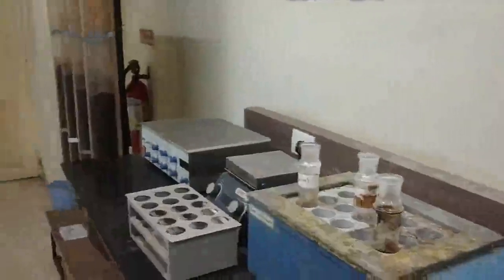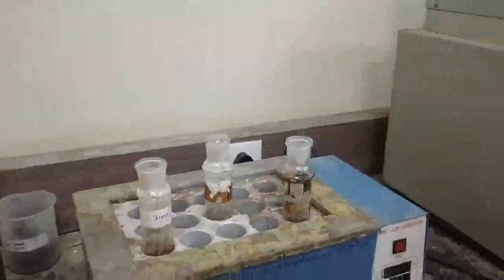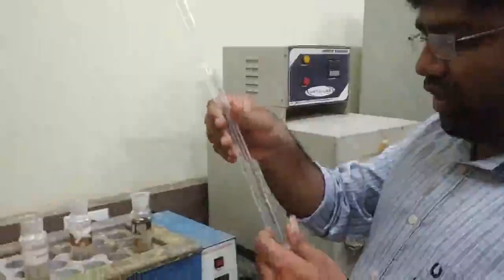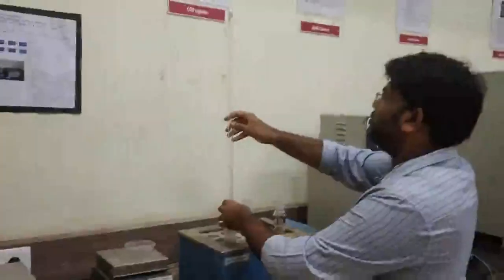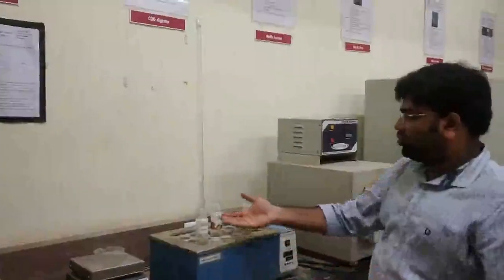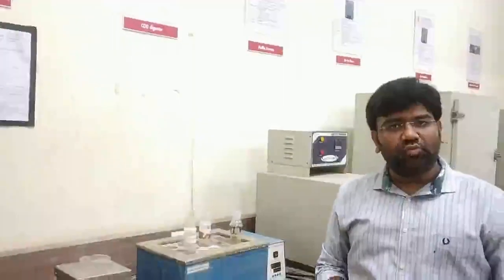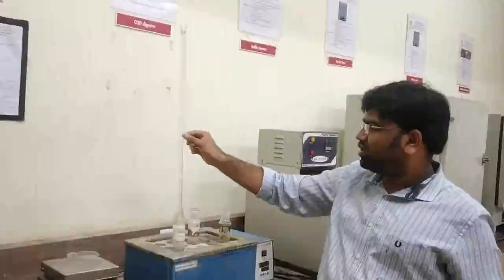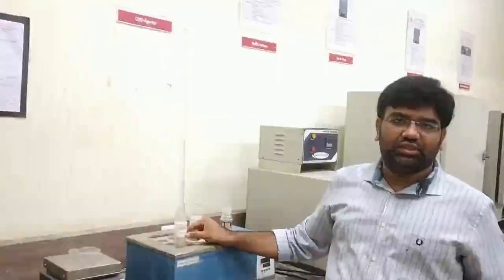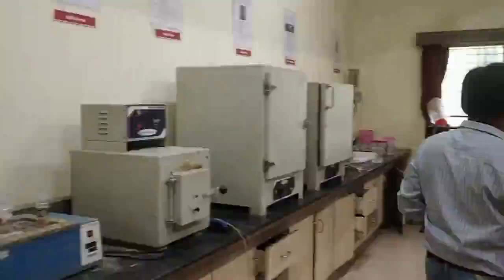Okay, we are going to attach the reflux condensers. So three reflux condensers will be required. This is called a reflux condenser. I will be telling you the use of the reflux condenser. When the sample is kept at 150 degrees Celsius for digestion, the fumes are going to come out, so we need to catch those fumes as well. All those fumes will get collected here, and after some time they will fall back into the flask. So this is called the reflux condenser, right? So I'm going to attach it.